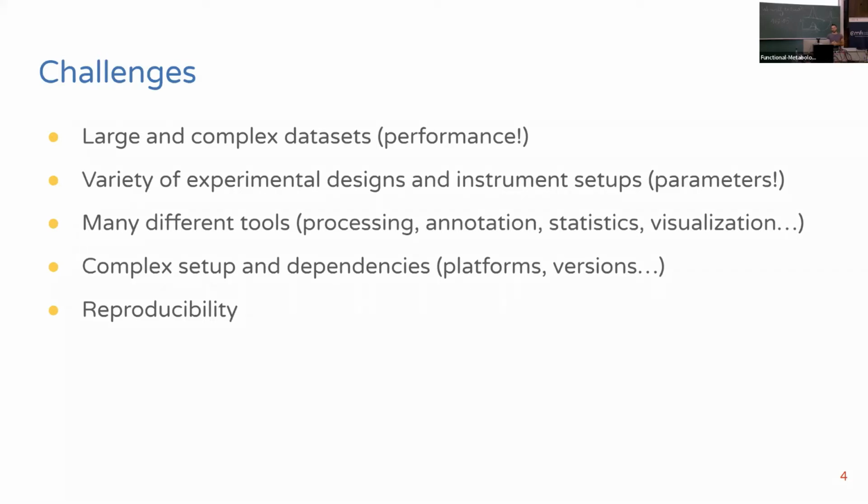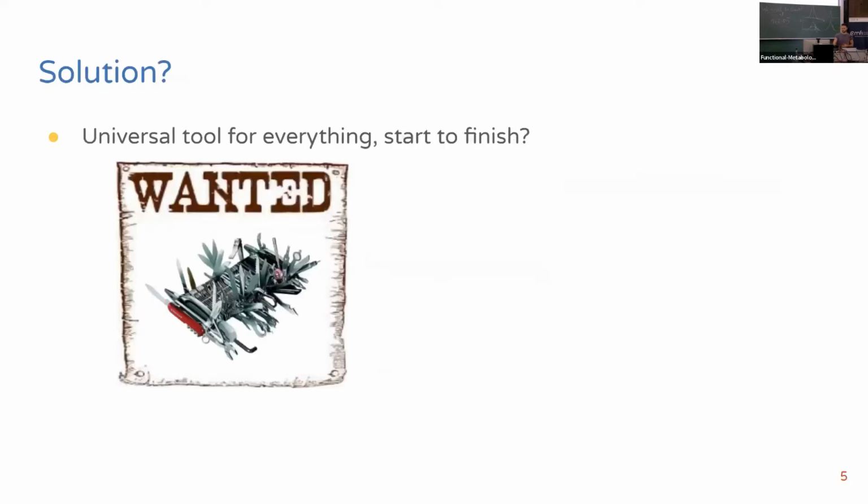And that already includes the last point, which is reproducibility. If I have managed to set up such a complex workflow on my machine, it doesn't mean that my colleague in the lab can do the same thing easily as well. It's just tailored to your machine, and we need to find ways to make this accessible and shareable for all other people as well.